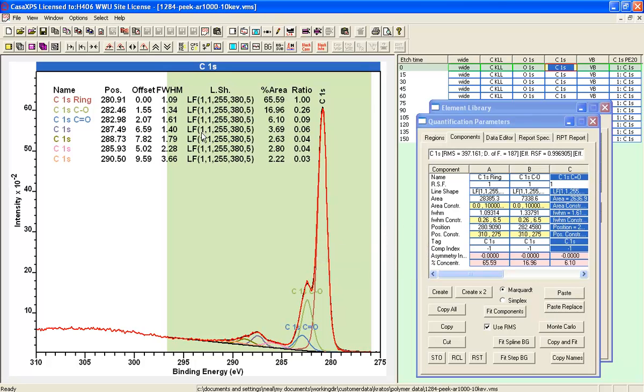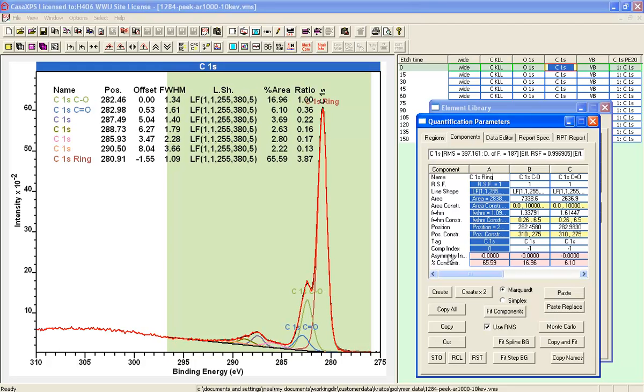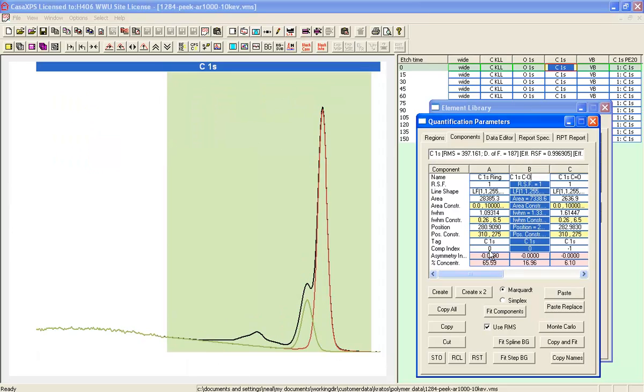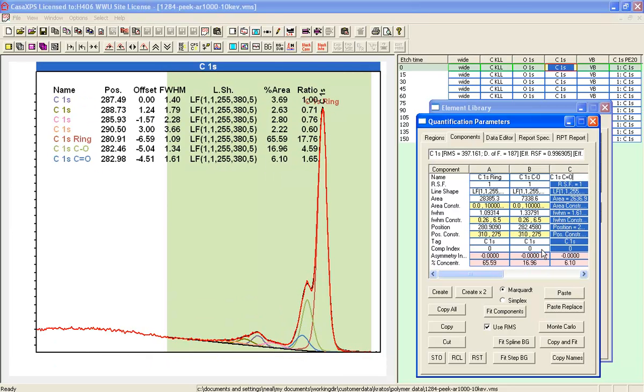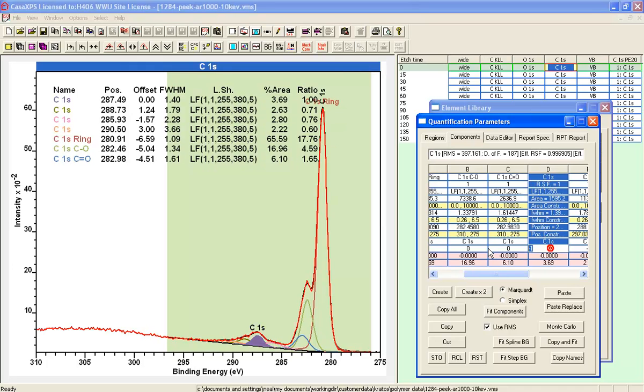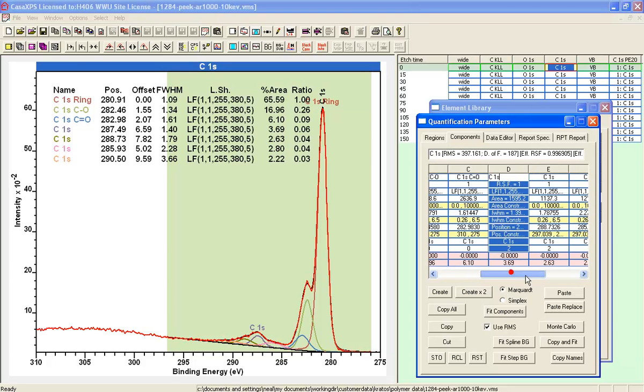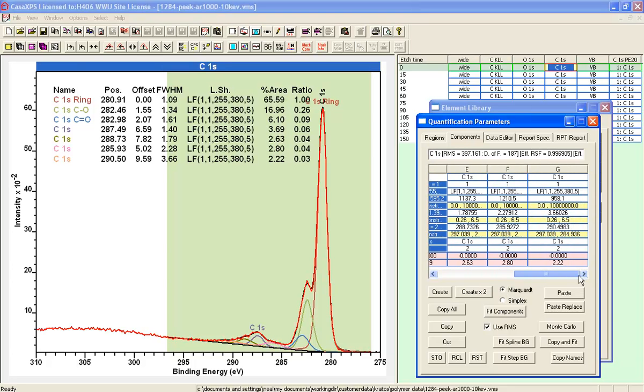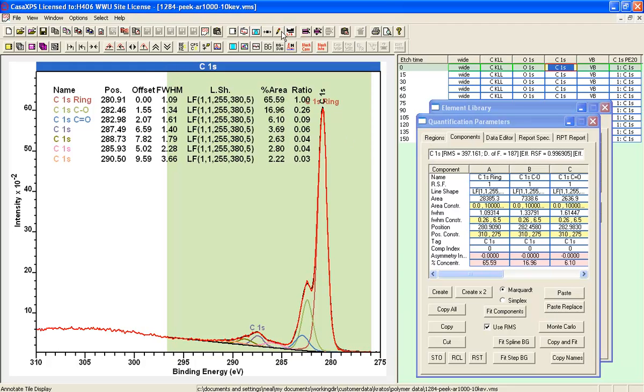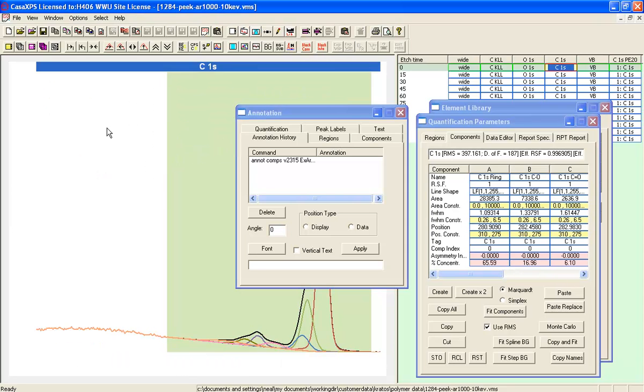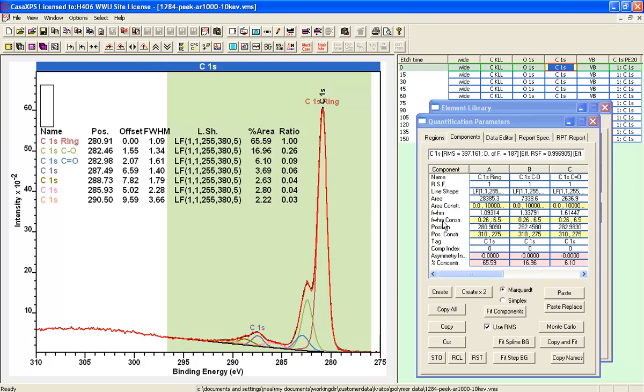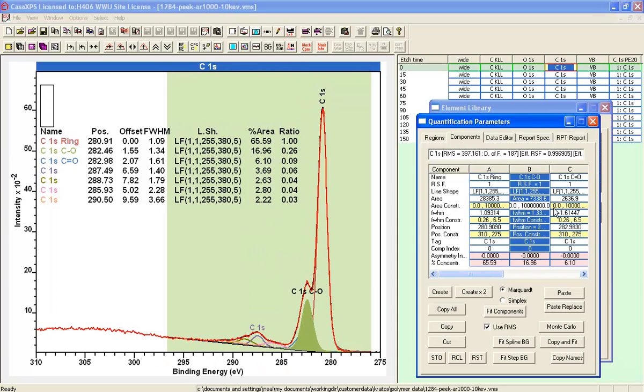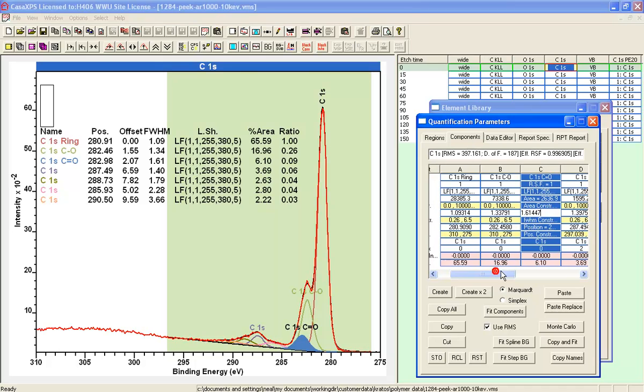One of the ways that we can manage a table such as this annotation table where we want to see ratios of peaks and offsets from a specific peak is to use the component index on the component property page. If we set these component indices, the order of the table will change depending on the lowest value for the component index. Currently the C1s ring has the lowest component index value of zero. Later on we can adjust these values so that we get the order that we'd like to see in terms of ratio and offset.